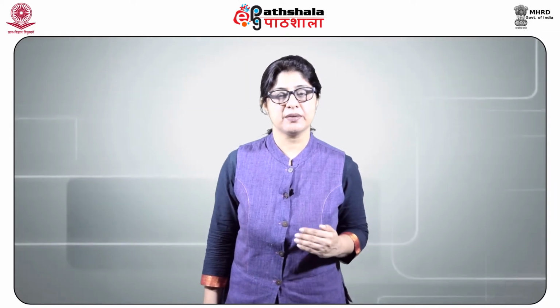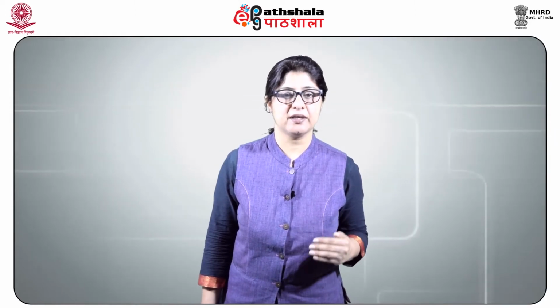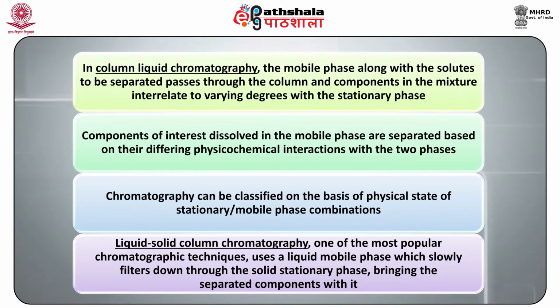or an immiscible liquid. Liquid chromatography is used for analytical or preparative applications. In column liquid chromatography, the mobile phase along with the solutes to be separated passes through the column, and components in the mixture interact to varying degrees with the stationary phase. Components of interest dissolved in the mobile phase are separated based on their differing physiochemical interactions with the two phases.